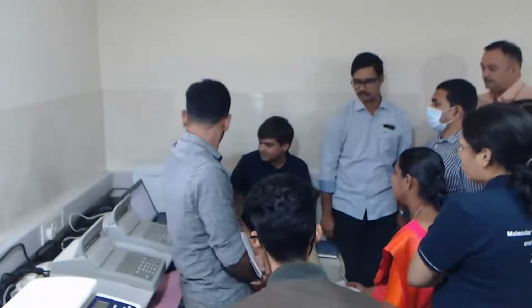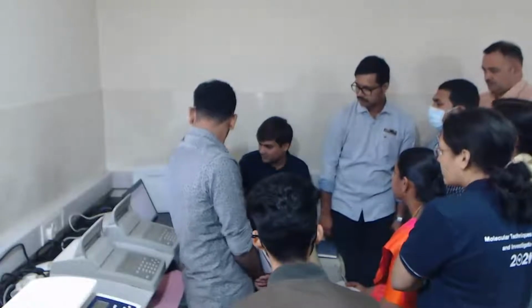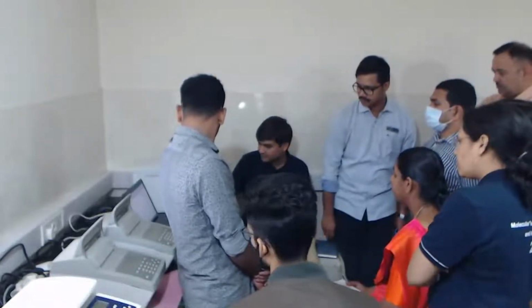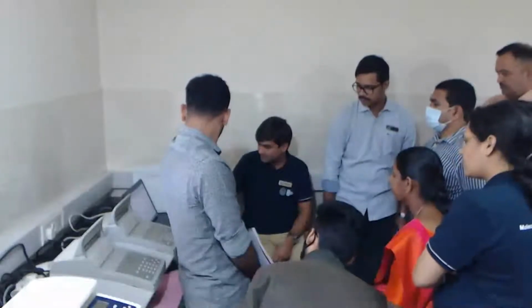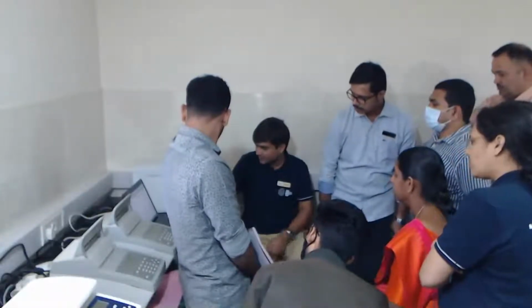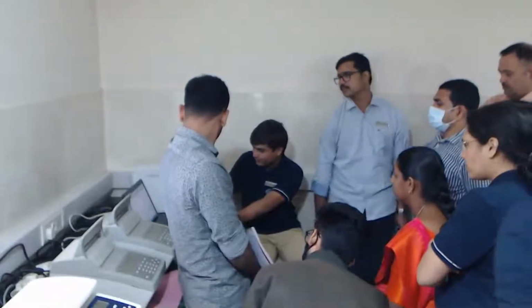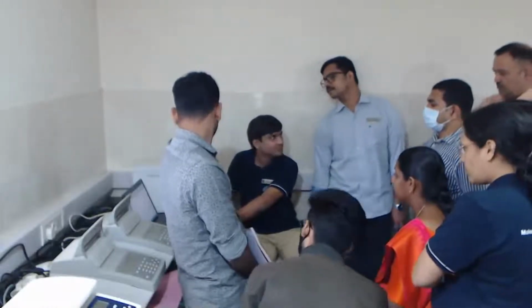Now this same exercise I will perform for all the samples. Over here also I will go till 500, and you will see that there are a few fragments which are bigger.